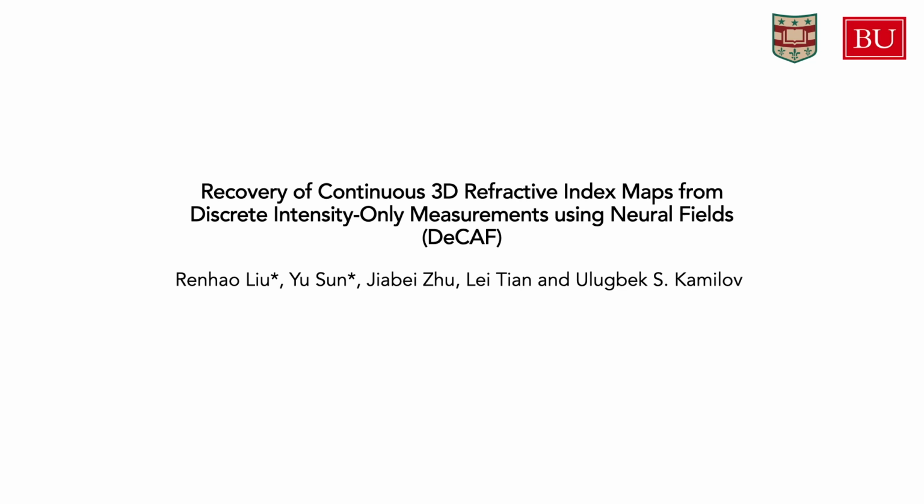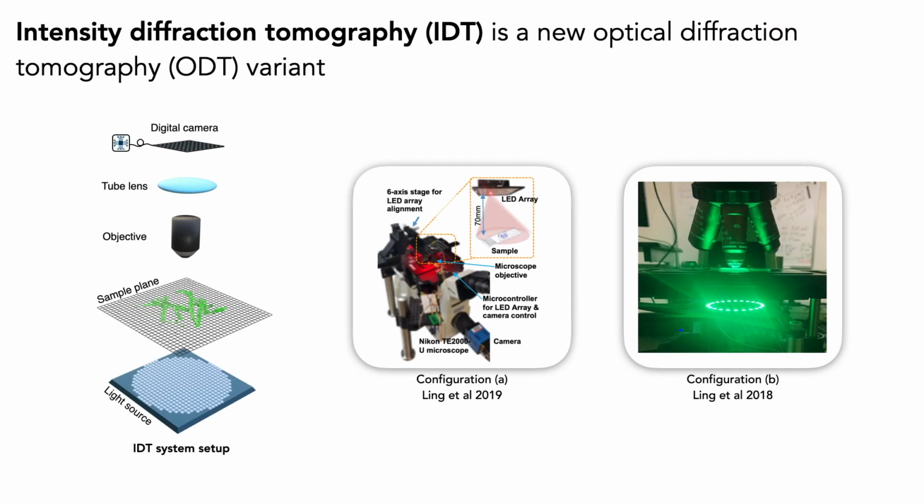We present recovery of continuous 3D refractive index map from discrete intensity-only measurements using neural fields, or DeCAF. In this work, we consider a specific microscopy modality named intensity diffraction tomography, or IDT. IDT is a non-invasive, label-free tomographic imaging technique.